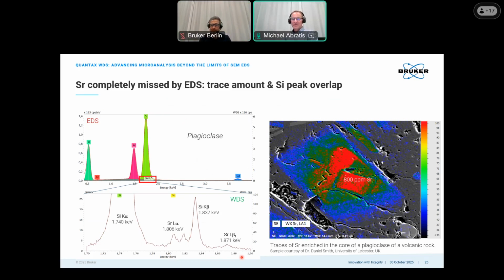For me, I think it's not complicated. With EDS, you have standardless quantification, and the simplest way is pressing the button and letting the automation do its work. I always recommend using our perfect deconvolution interactively, so check the quantification results, that every element is identified by EDS.